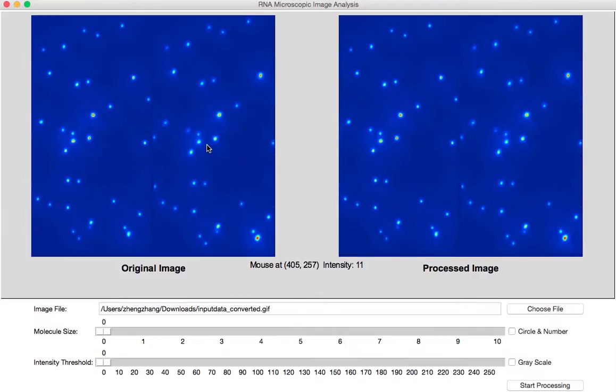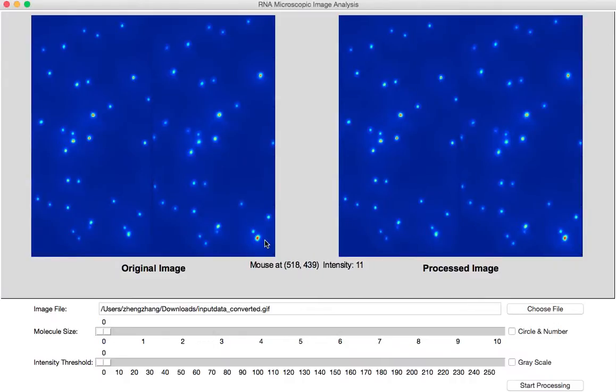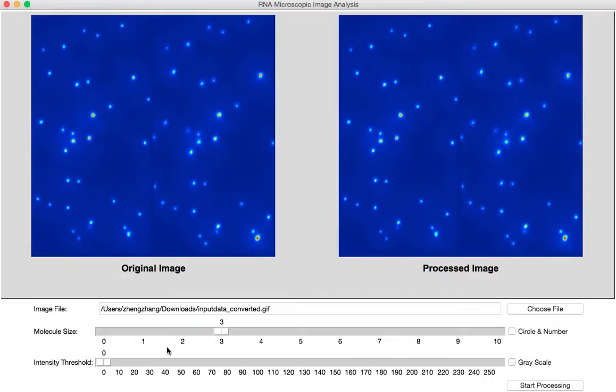Because too small a spot may be noise and too big a spot may be multiple molecules conjugated together. So now we set the molecule size to be 3. And then we need to set another parameter, the intensity threshold.